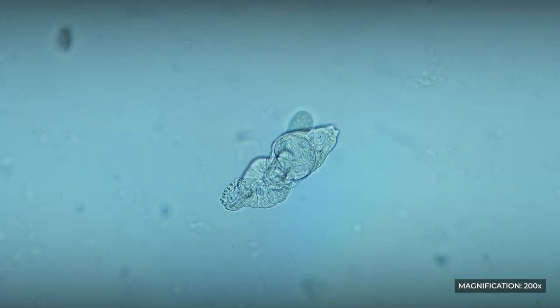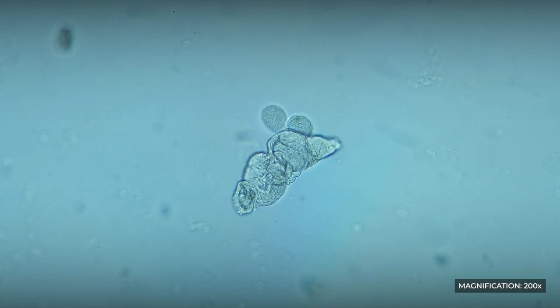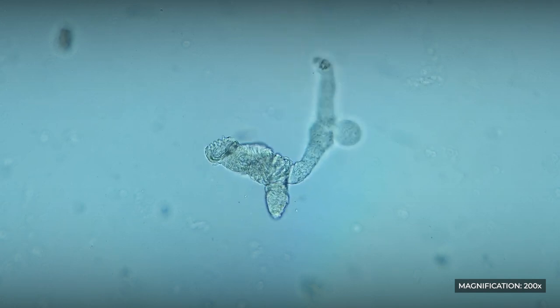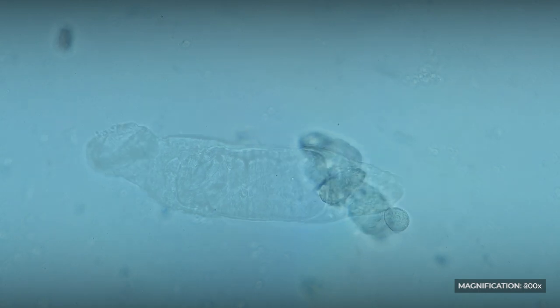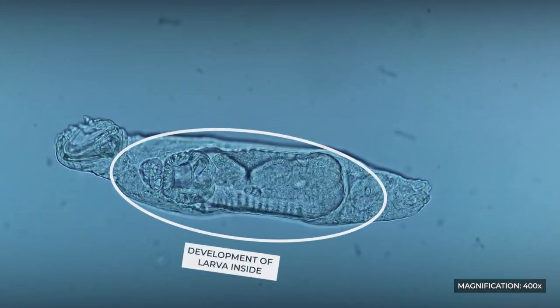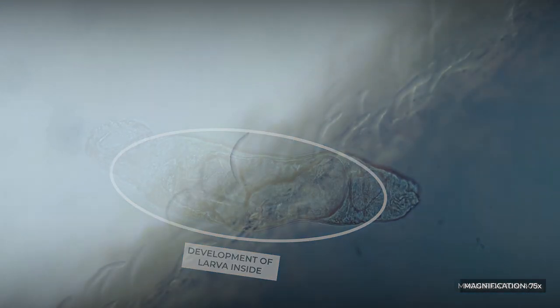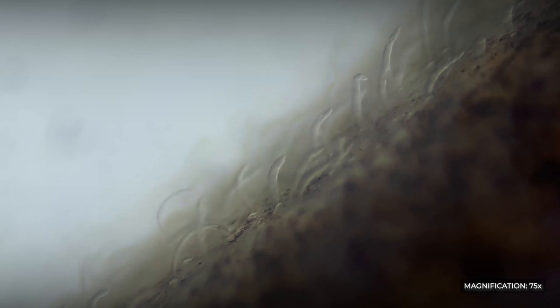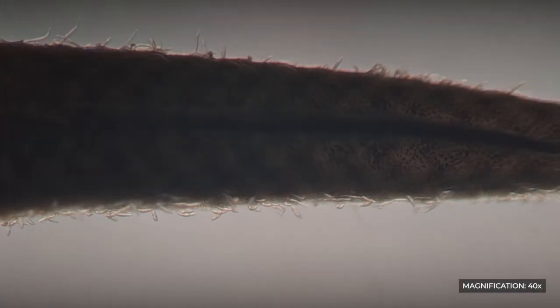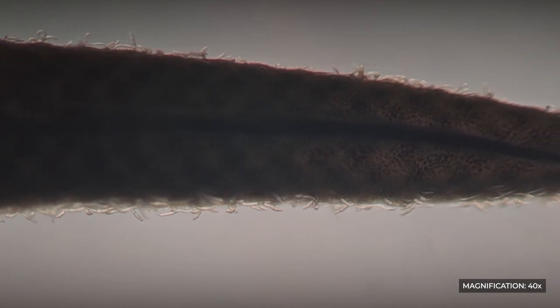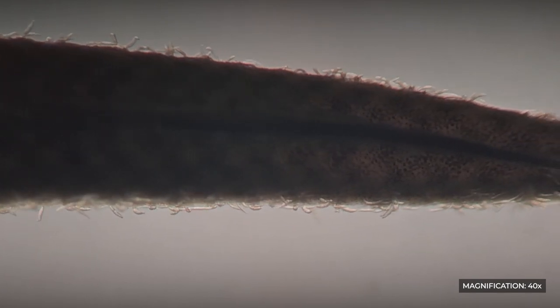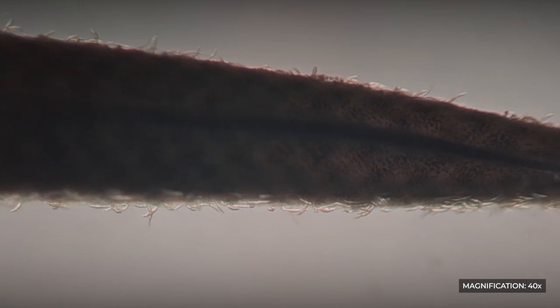Skin flukes are viviparous hermaphrodites, so it is often possible to observe the development of second-generation larvae inside the body of one worm. Gyrodactylus can undergo a significant increase in population density, covering the entire body of the fish. These parasites pose a particular threat to young fish, often leading to mass mortality in aquariums and ponds.